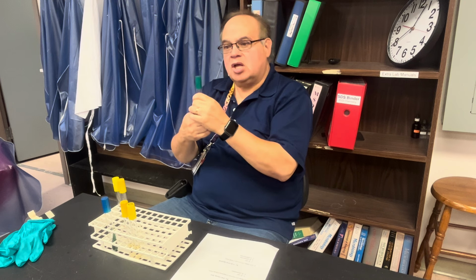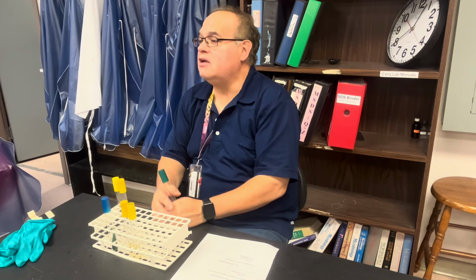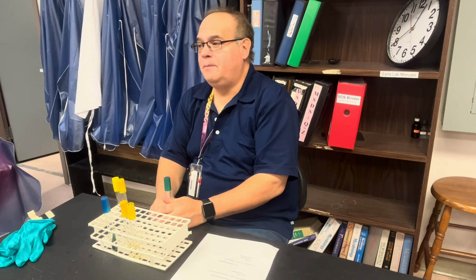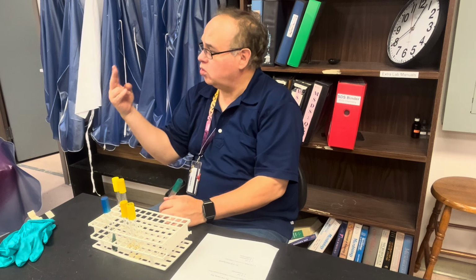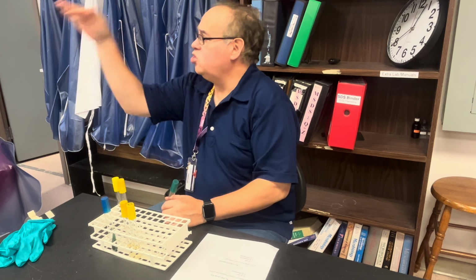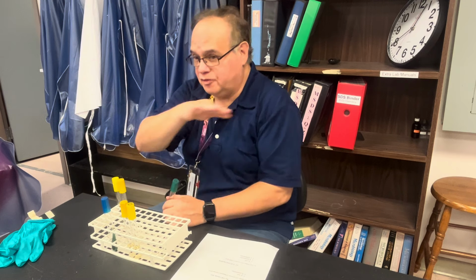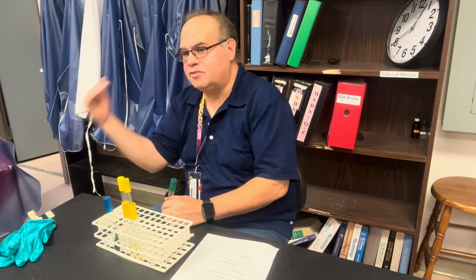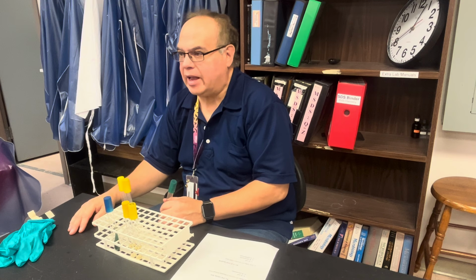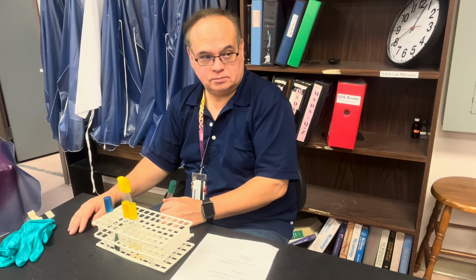It's the gas. For the scope of this exam, this practical only, if it's black, we're going to say it's motile. But there are 2 organisms that produce hydrogen sulfide that are not motile. So when you do your unknown, you're going to have to do a separate motility test. But for this practical, so we don't have to do another test, we're just going to say it's motile if it's black. You said motile or mobile? Motile.